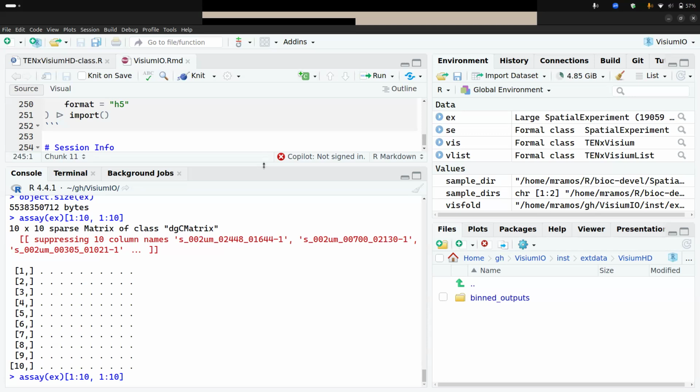I have a question about the in-memory matrix. There is also this sparse array package. Is there a plan to maybe support that, or will this just stay with the current one? Well, I don't know if sparse array uses matrix market format. But I guess if there's a way to convert to sparse array, it might be possible.